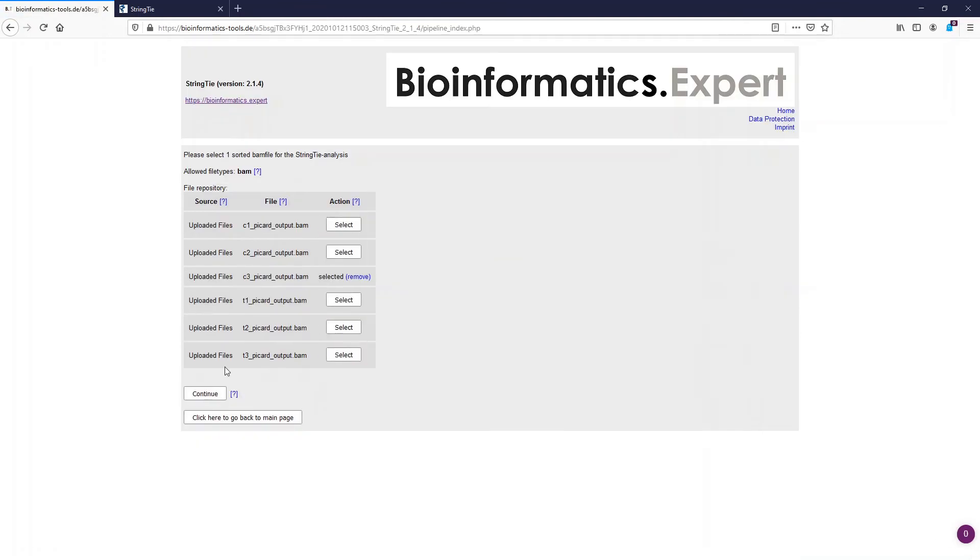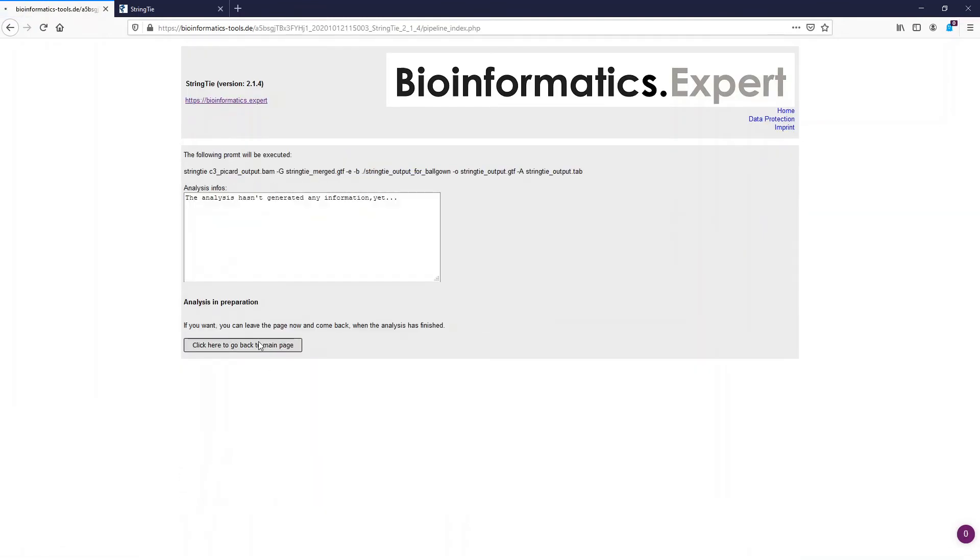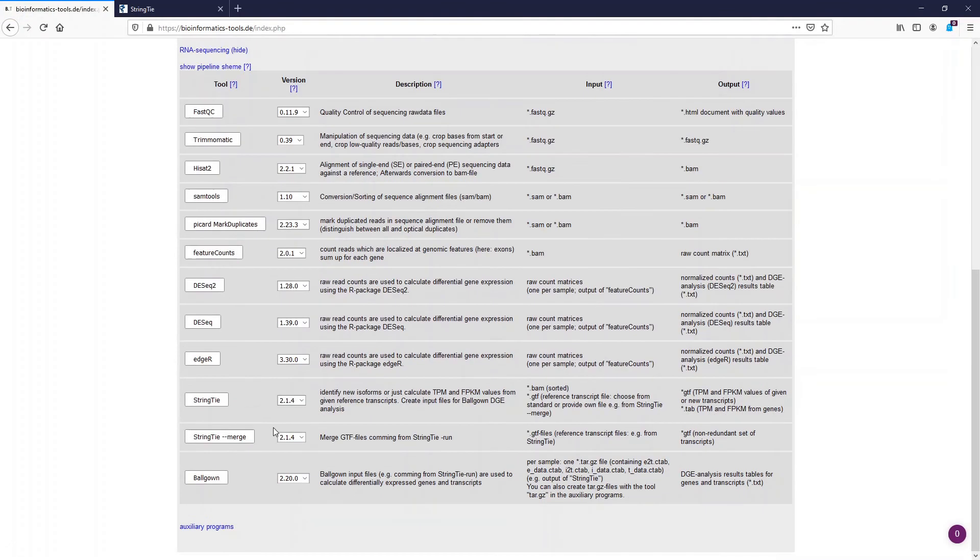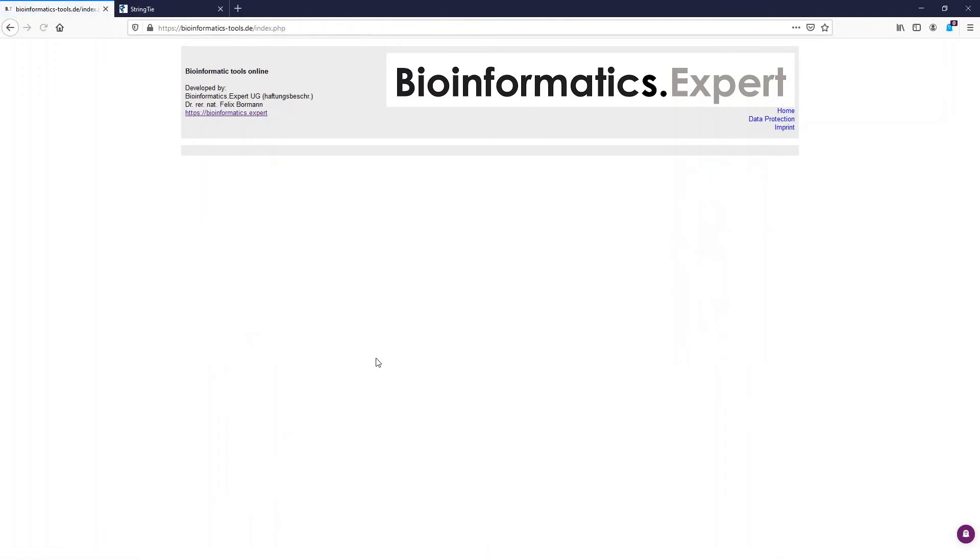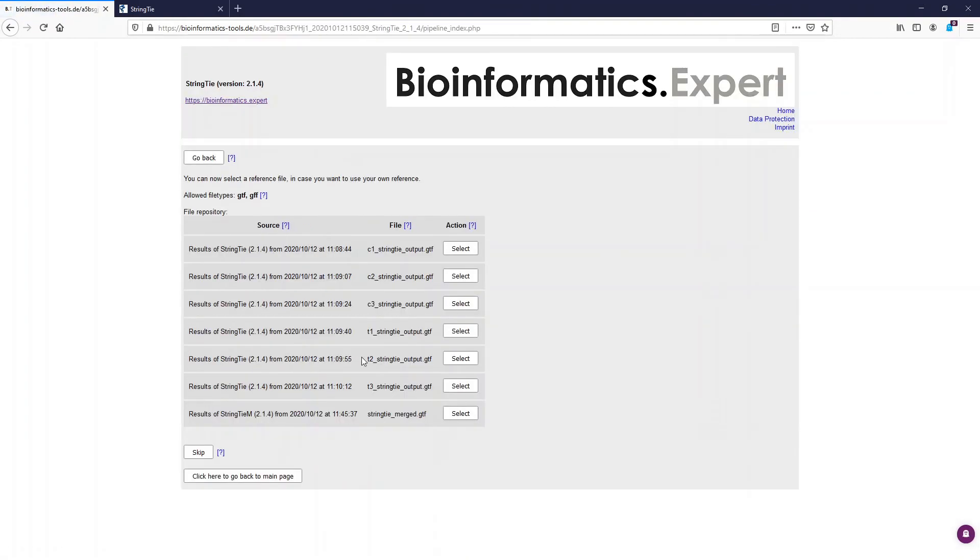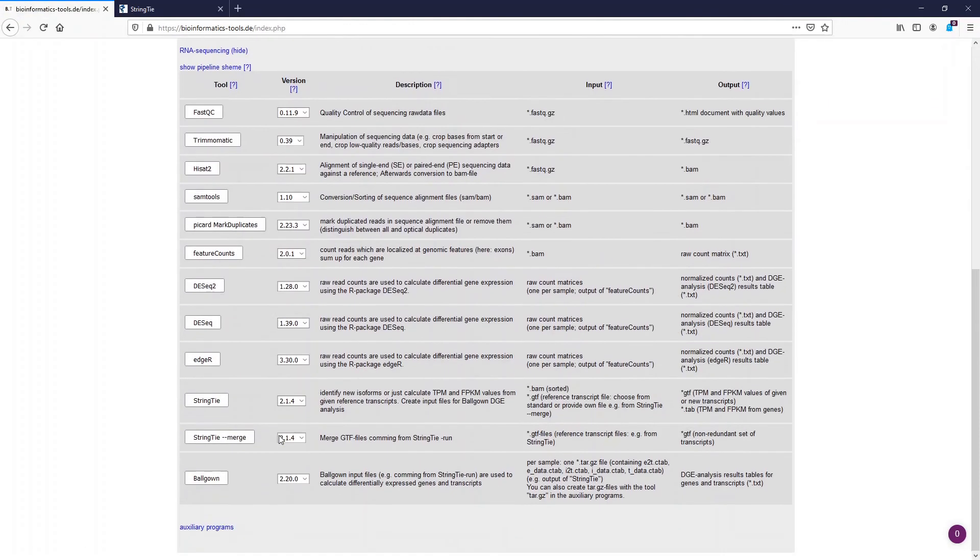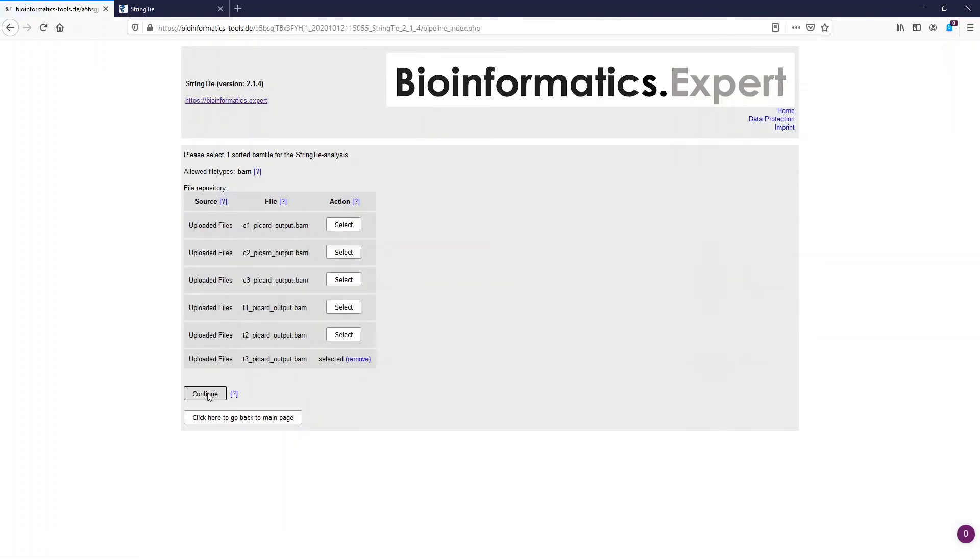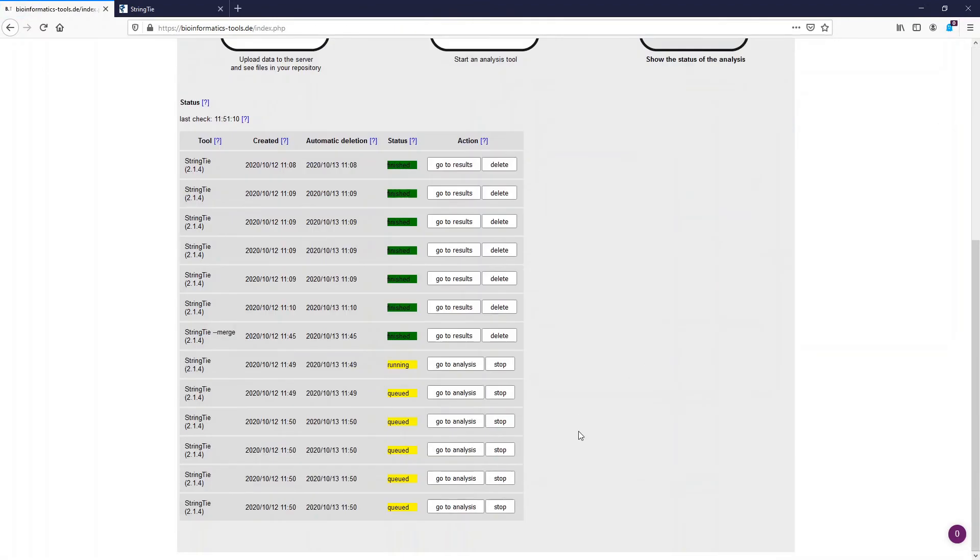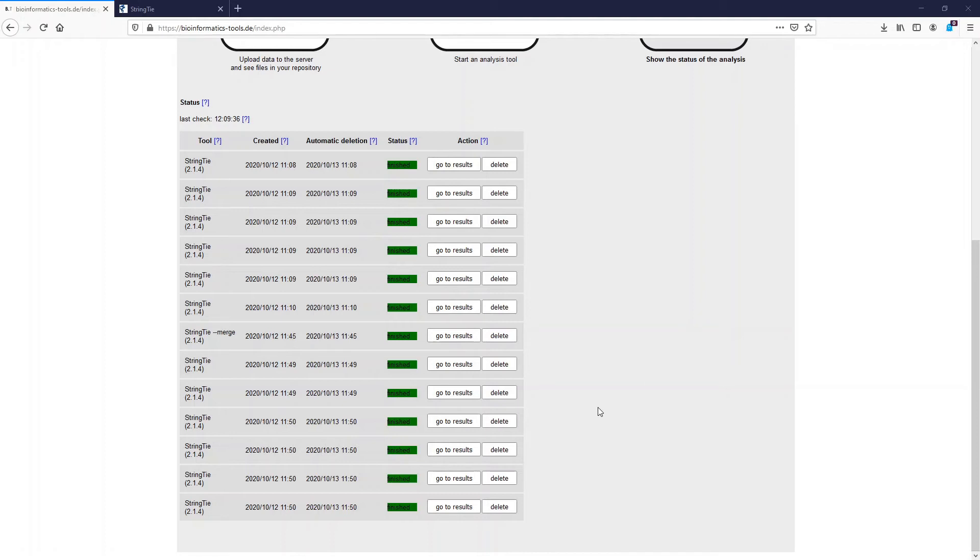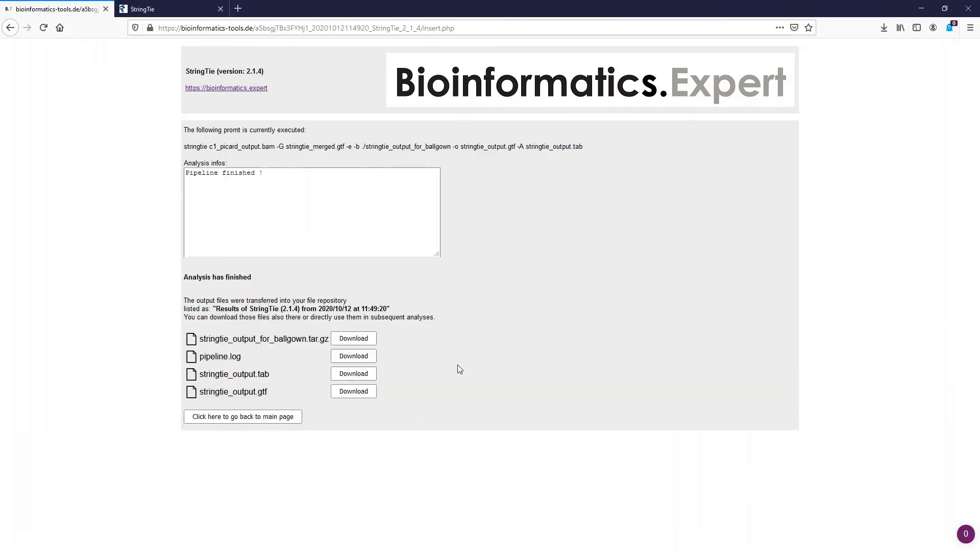Again some fast forwarding. And now we skip the part where we wait for the analysis to finish. Now we can again open one of the analysis pages and we see the output of the StringTie runs now. Again we see the GTF file and the tab file. However we also see a tar file containing the Ballgown input files for the sample.